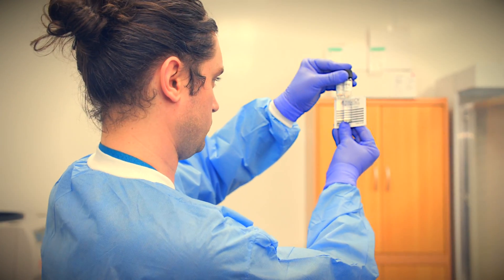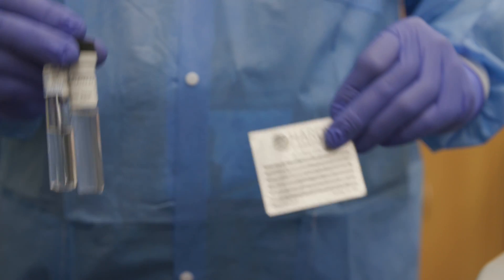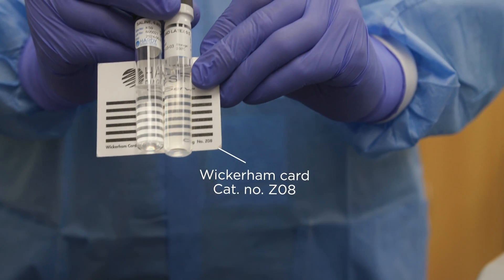Using a bright light, compare the 0.5 McFarland standard against the bacterial suspension using a white card with contrasting black lines. This card is called a wickerham card.